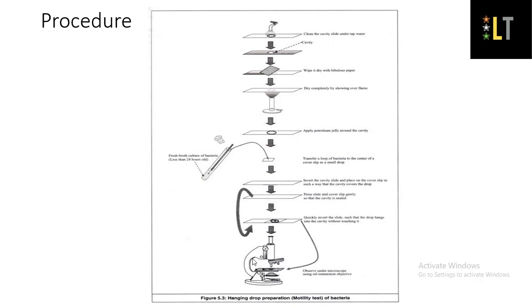just above the hanging drop, and the edge of the hanging drop is observed under the oil immersion objective of the microscope. Now we will see the observation. Here you can see the bacteria moving from one place to another in this video.